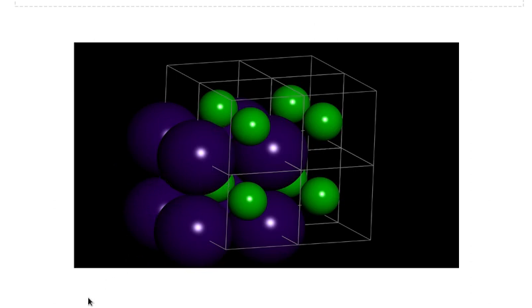So that's what we're trying to do here. We're trying to match the spectra to the face-centered lithium chloride. We're trying to match a spectrum to the primitive cesium chloride, and we want to then calculate from lithium chloride the ionic radius of chlorine, because it's so big in lithium chloride. And then once we know the ionic radius of chlorine, we want to calculate the ionic radius of cesium with the cesium chloride.